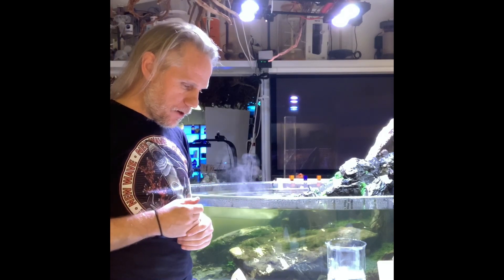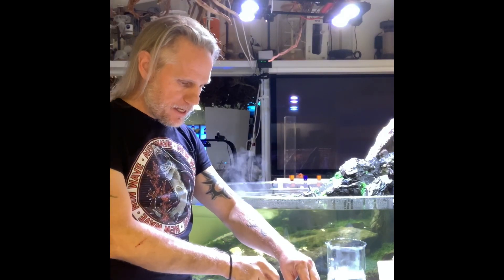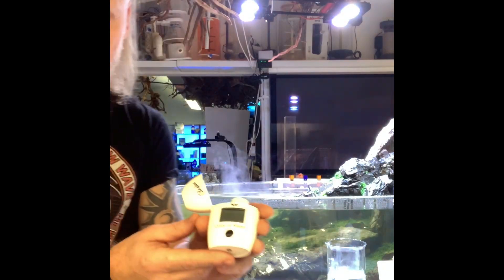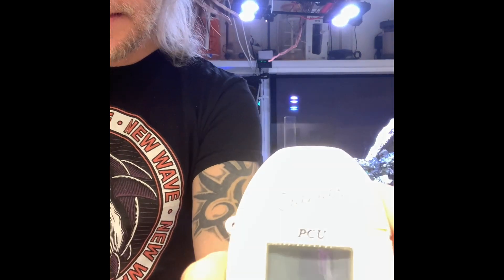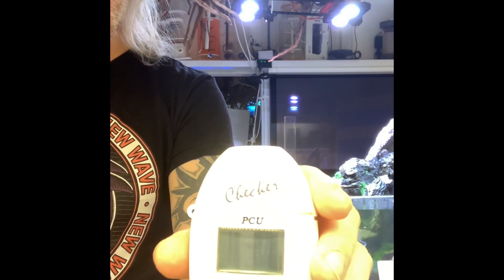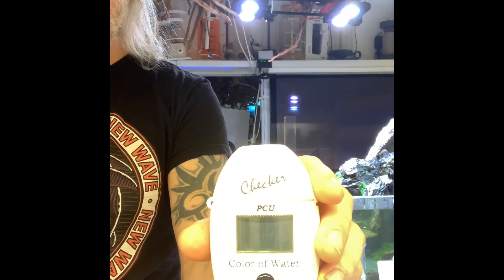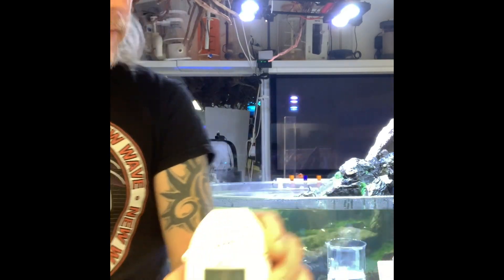What I'm going to use is a Hannah checker — this little device. It gives you the reading in PCU and it measures the color of water.